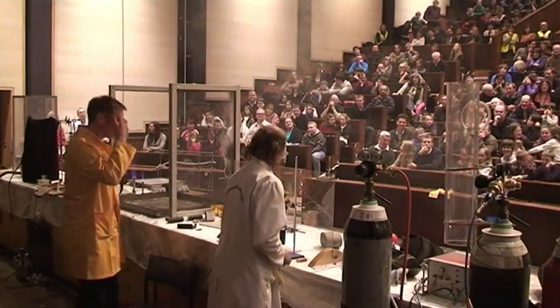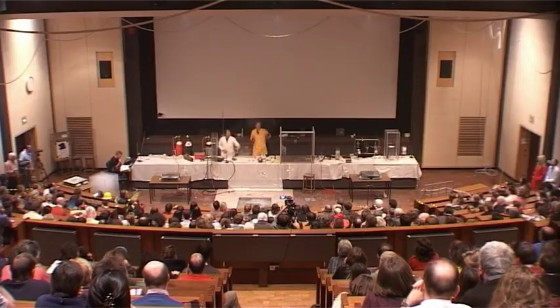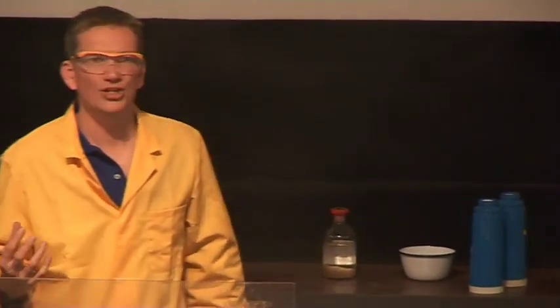Thank you. So we've seen gases burning mainly by combining with oxygen, but it is possible to have things burning with other gases. Chlorine is one gas. It's a very reactive gas. So perhaps this would be another way that life forms could exist, not by breathing in oxygen, but by breathing in other gases like chlorine. So we could perhaps get chlorine life forms on different planets. We can get energy from the reactions of different substances with other gases other than oxygen.